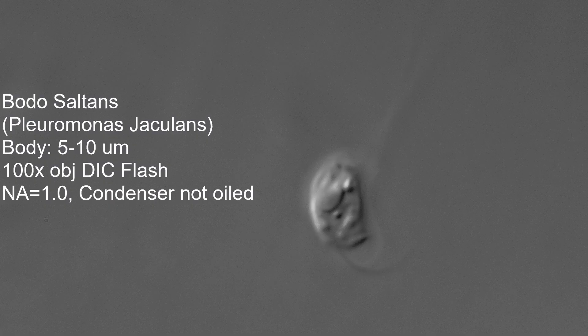Here's an attempt at 100 power. If you think they go in and out of focus fast at 40 power — I didn't use the full NA of the Olympus BH2 because I didn't oil the condenser, just the objective. So the working NA is about 1, but that turned out pretty nice.